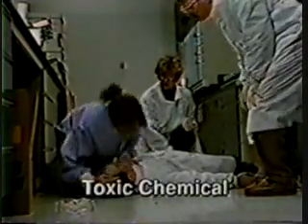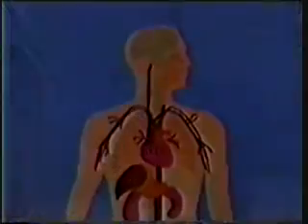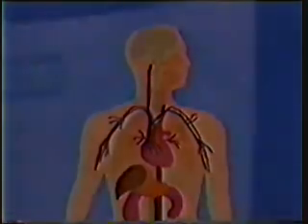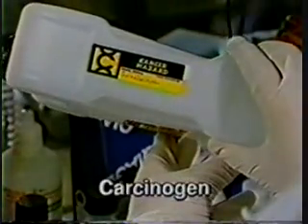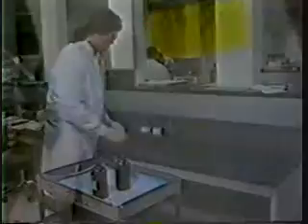A toxic chemical has the potential to disrupt bodily functions, such as breathing or blood circulation. Some toxic chemicals have target organ effects, which means they damage specific organs, such as the lungs, kidneys, or liver. A poison is an extremely toxic substance that can cause death in a short period of time, even in a very small dose. And finally, a carcinogen, as you know, is a substance that can cause cancer.